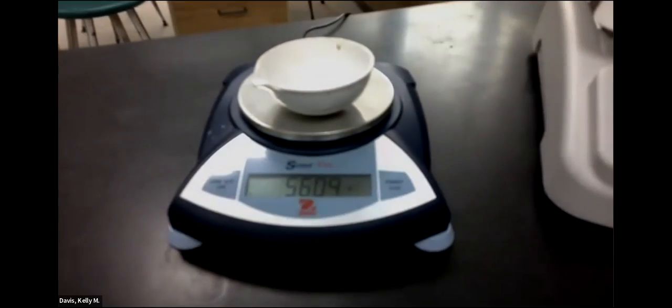It's good. All right. And that is all the data. And let me know if you have any questions.